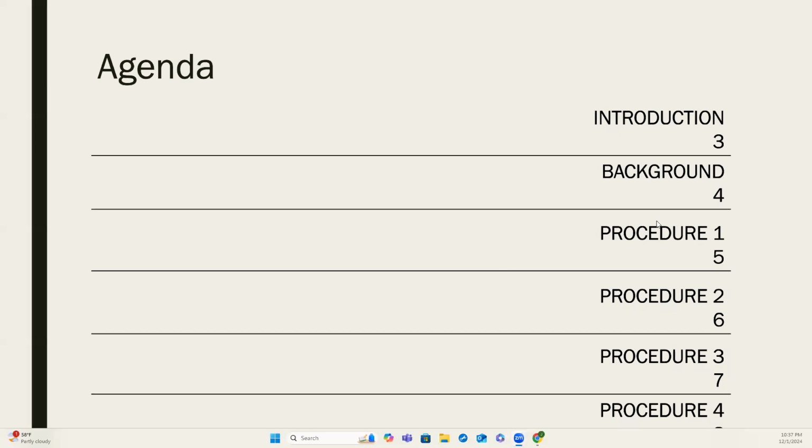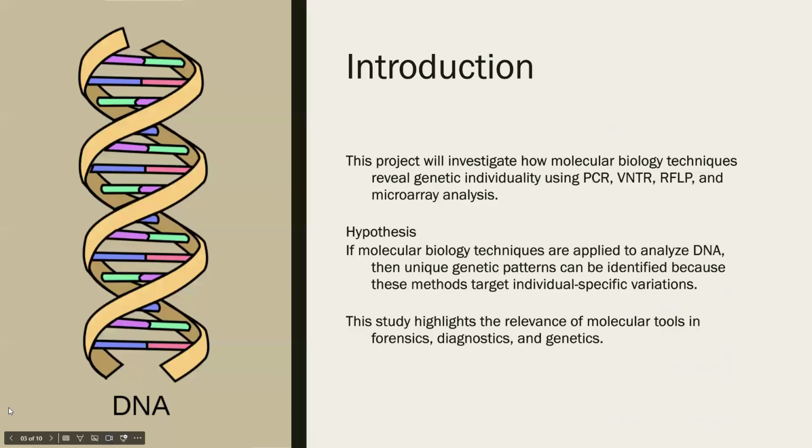In our agenda, we have the introduction, some background, and this lab has four procedures. This project will show how some molecular biology techniques work, such as PCR, VNTR, RFLP, and microarray analysis.